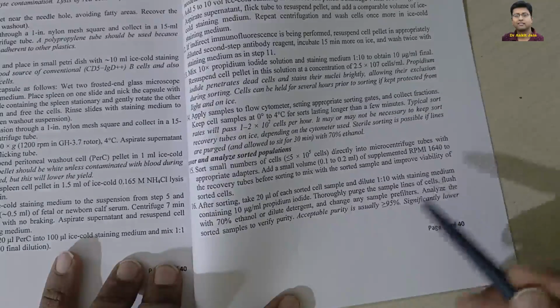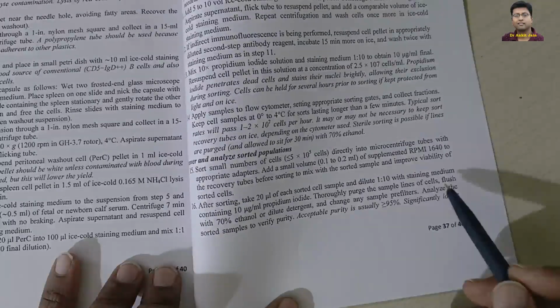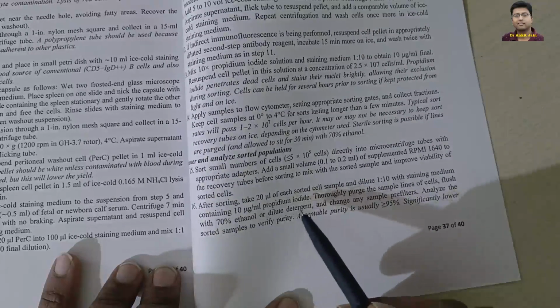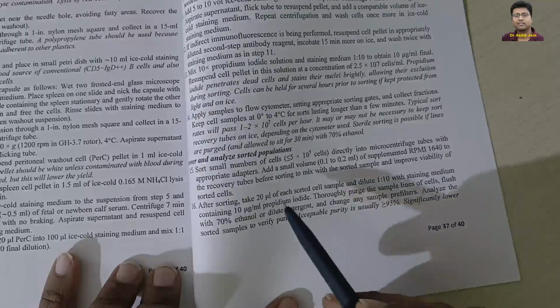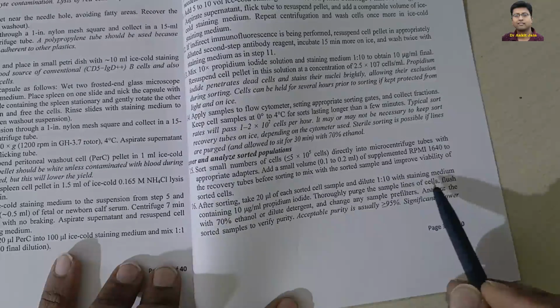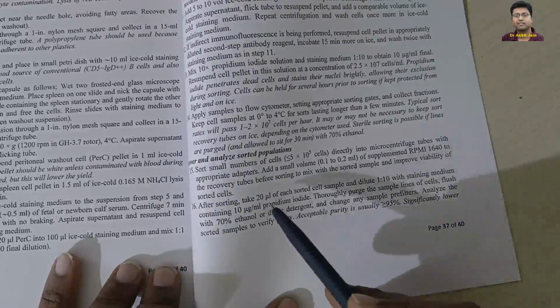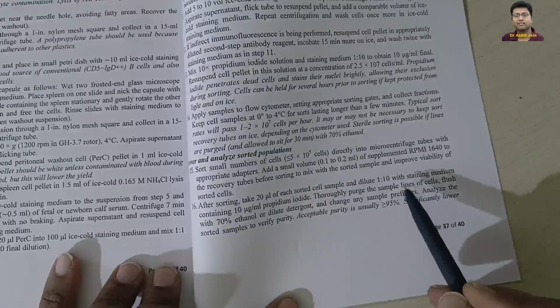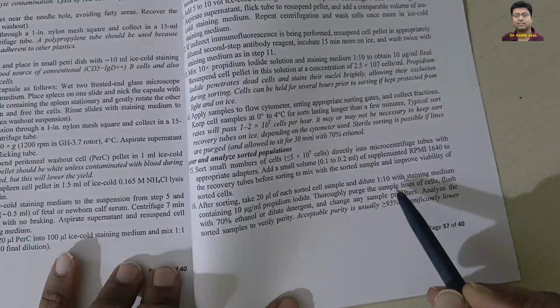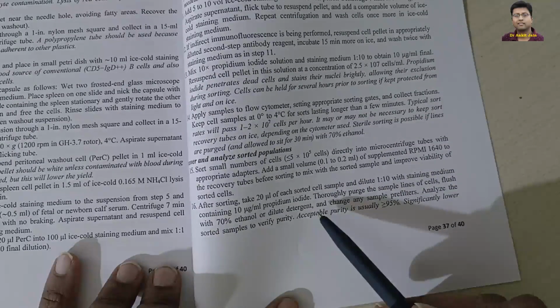अब इस पूरी प्रोसीजर में भी बहुत सारी सेल्स ऐसी होती हैं जो डेड हो जाती हैं. Then we have to again add staining medium containing 10 माइक्रोग्राम पर ml प्रोपिडियम आयोडाइड. So we have to take 20 microliter of cell sorted sample and 1:10 with staining medium containing 10 microgram per ml प्रोपिडियम आयोडाइड. तो 20 माइक्रोलीटर ये रहेगा. तो अगर 1:10 का प्रोपोर्शन अगर हम रखते हैं तो 200 माइक्रोलीटर के आसपास जो है हमारा प्रोपिडियम आयोडाइड रहेगा with the staining medium.